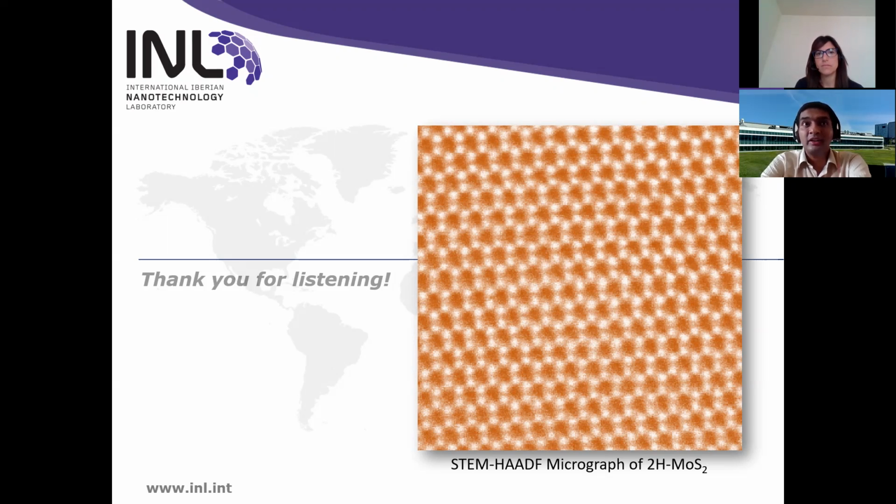Soft materials I have looked at, like dental implants and other things, but I really doubt about soft materials such as proteins, because even though the newer microscopes allow you to image them under an environmental condition, with relatively lower vacuum levels, materials such as proteins and those structures will disintegrate if you put them in a high vacuum mode.